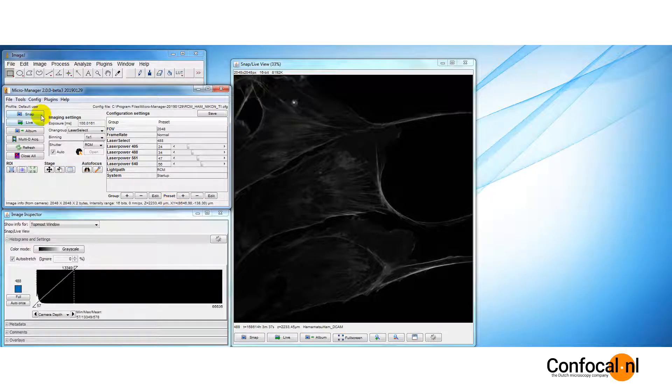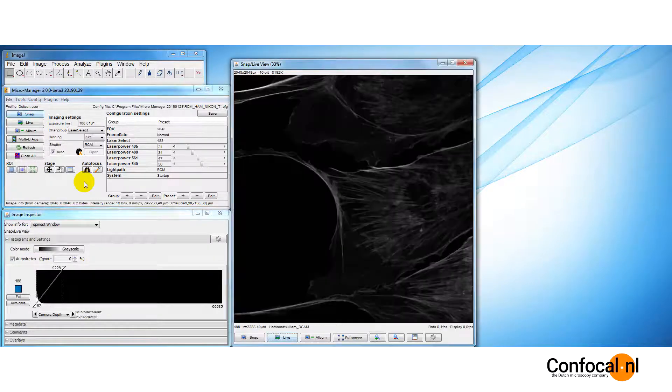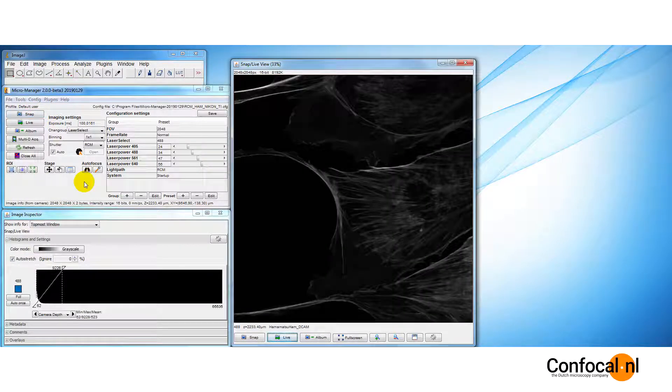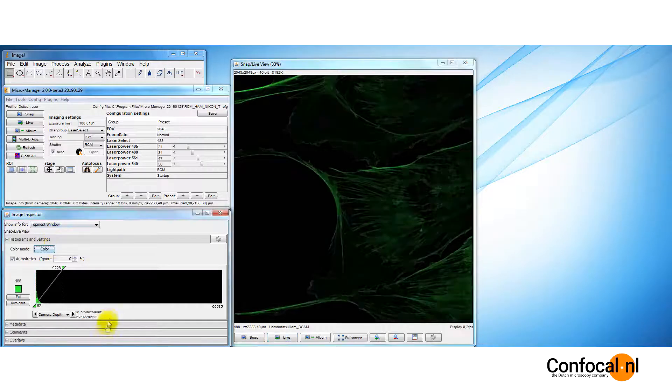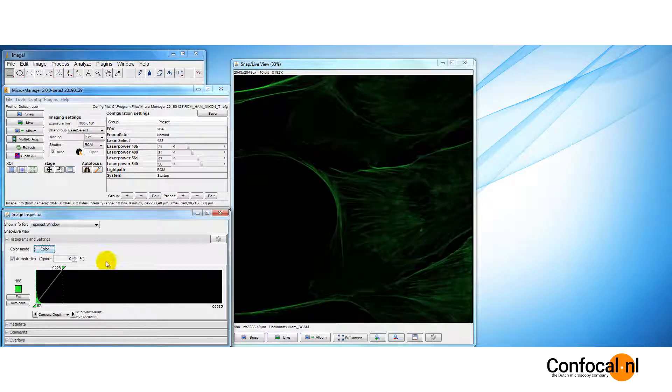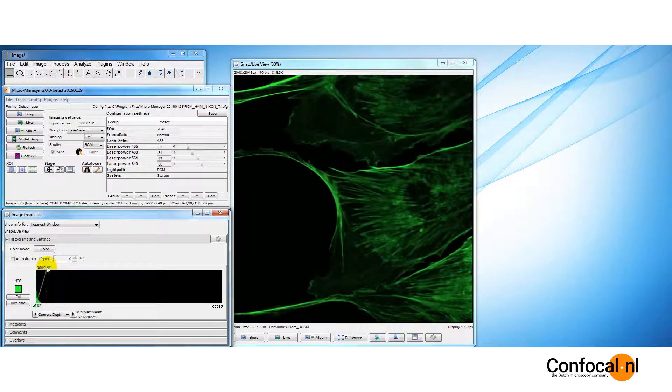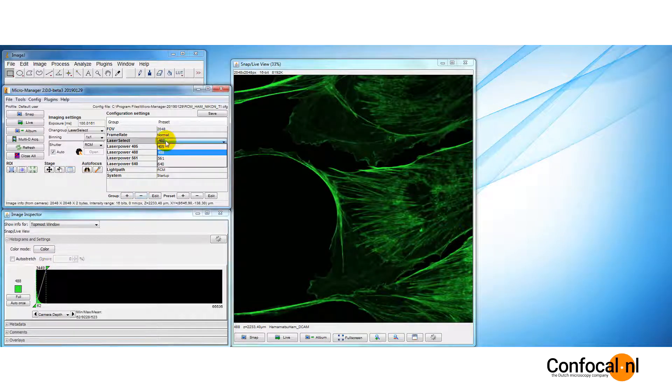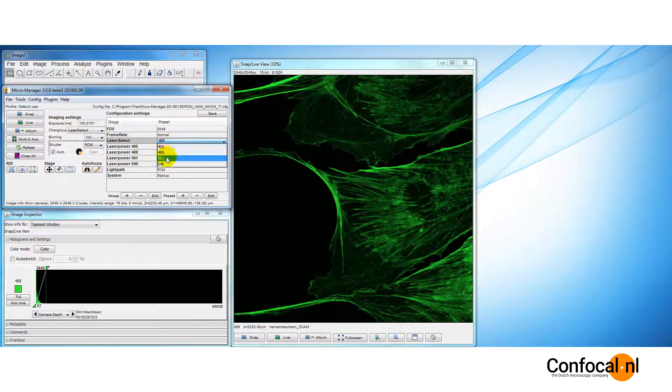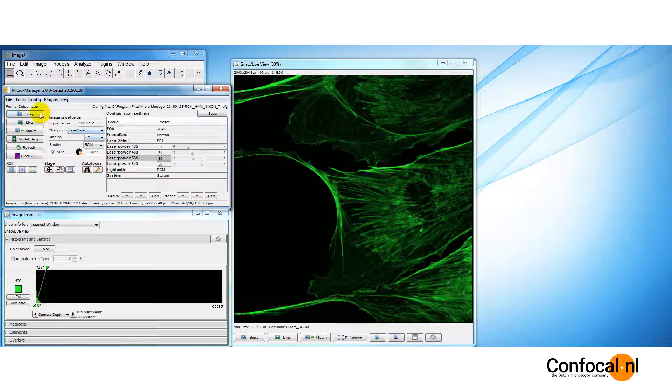Snap an image. If you wish to perform a multi-channel experiment, set laser powers for other channels as well, in the same manner as we described earlier.